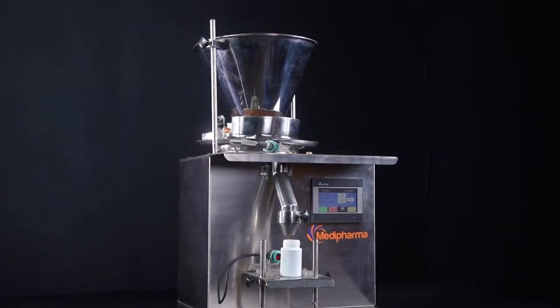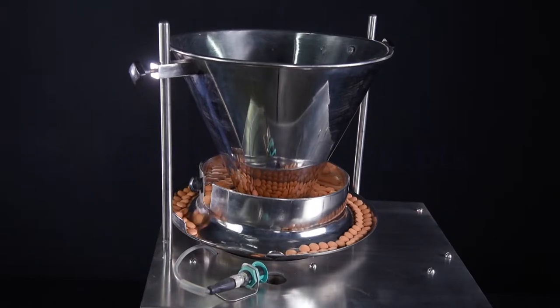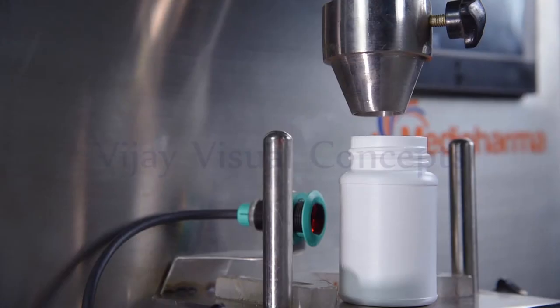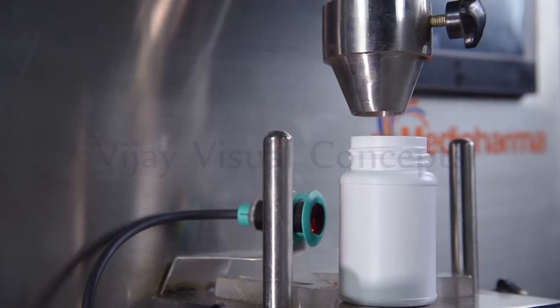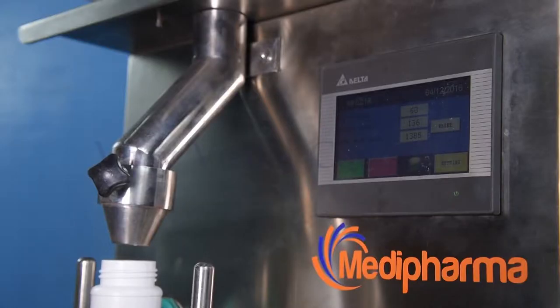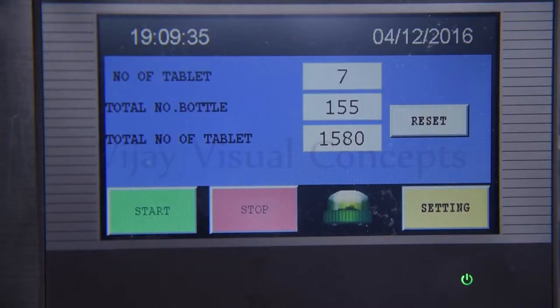Tablet counting machine consists of a rotary vibrator serving as a guide track. The precision vibratory controller ensures accurate dispensing of the product. It has a PLC controlled counting device with touch options.